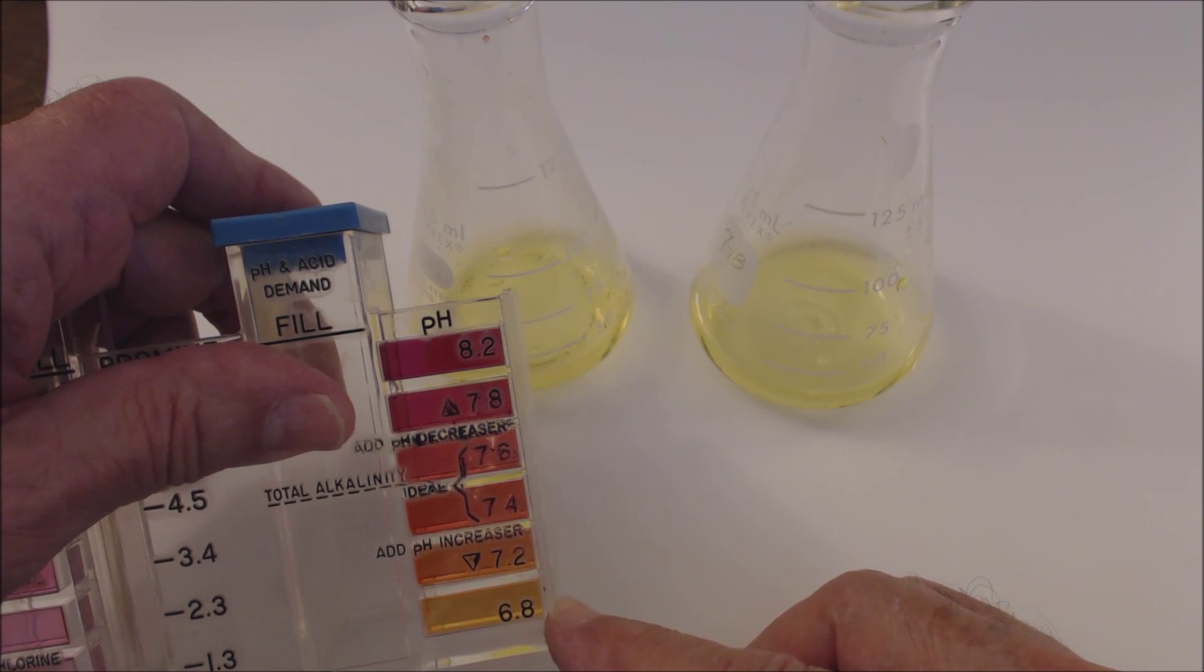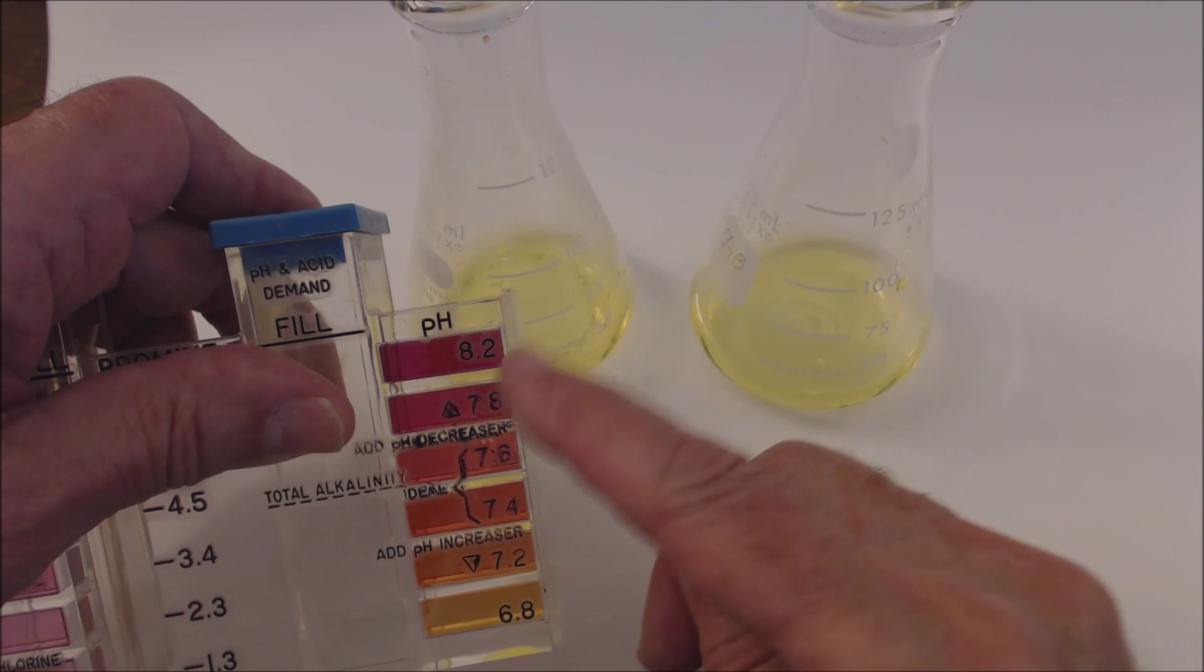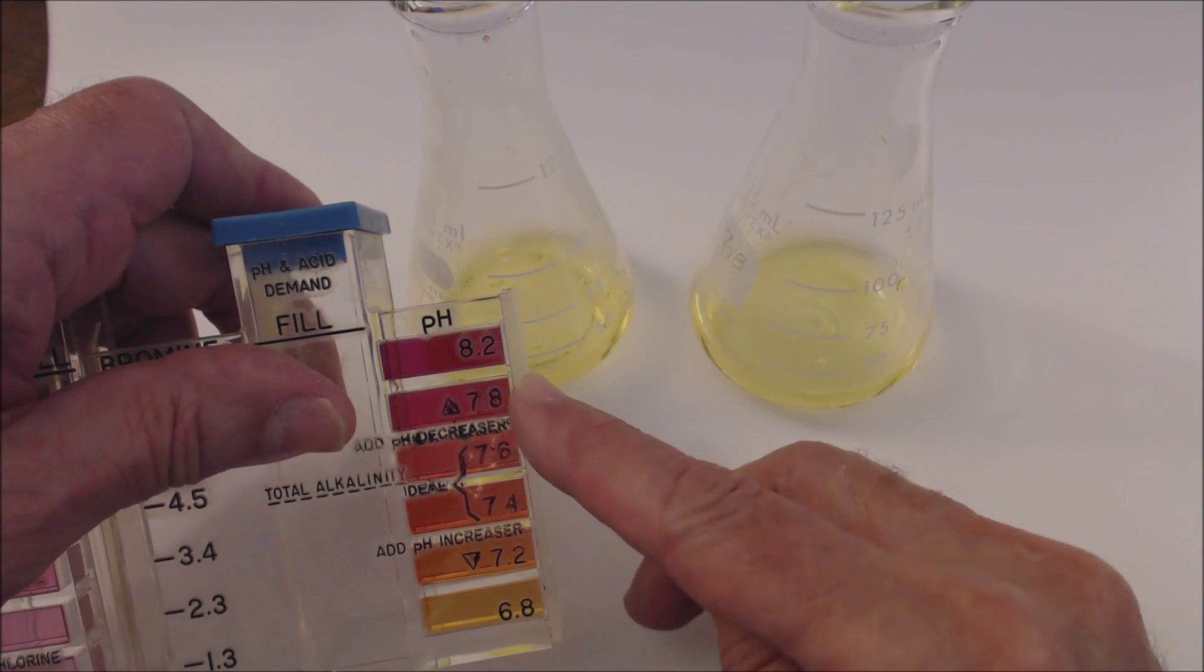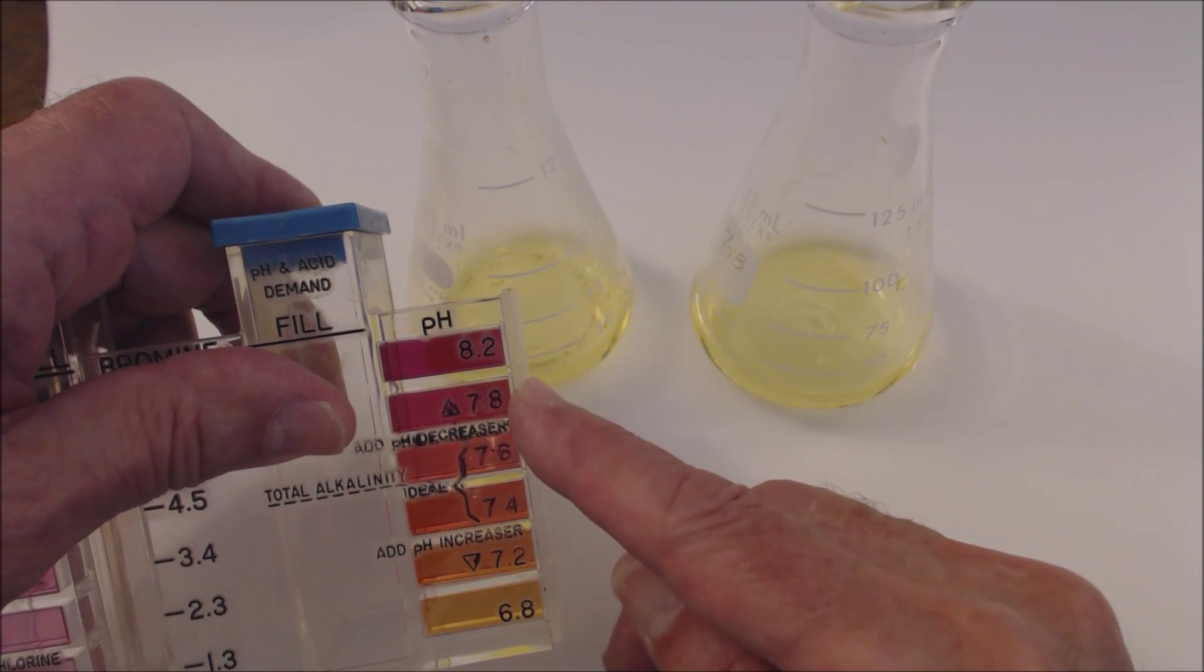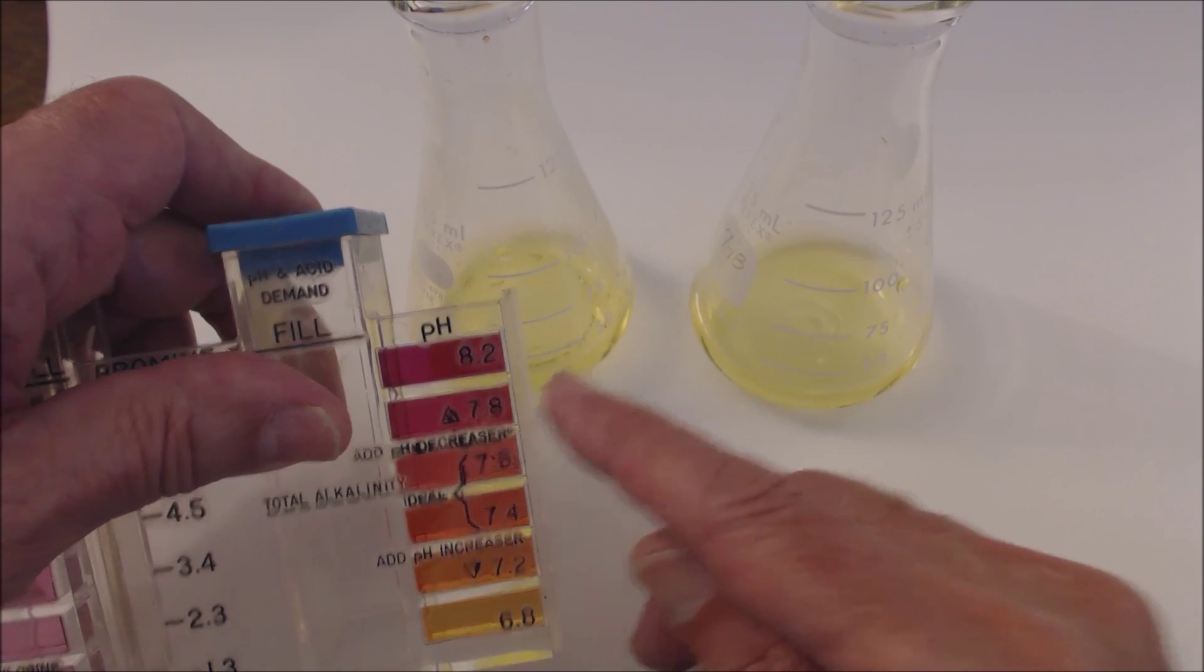Phenol red is yellow in the acid range, pink in the base range, and it makes a transition from yellow to orange to reddish between 7.2 and 7.8.